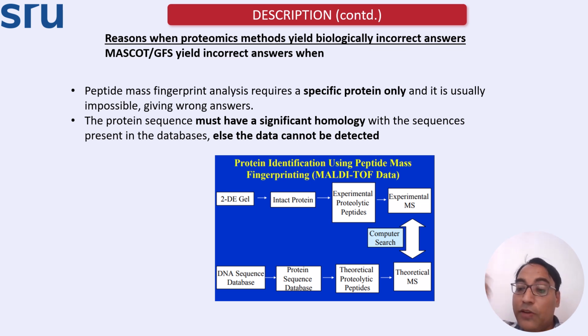Okay, it may be difficult to find out based on only one or two motifs or one or two conserved fragments. It may be difficult, because the probability may come only 0.5 to 0.6. That may be because of the contamination. Alright. So it becomes doubtful, like should I believe the results or not? So I need to do further checks. Okay.